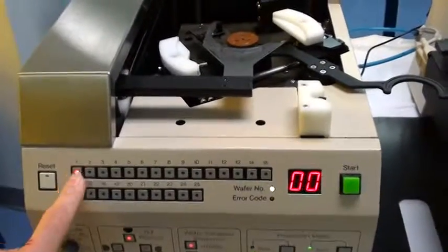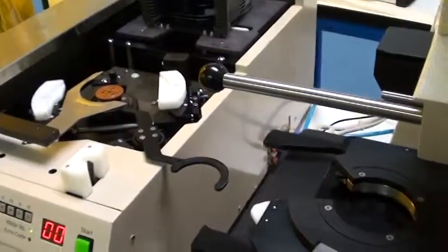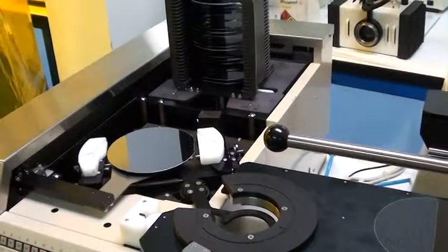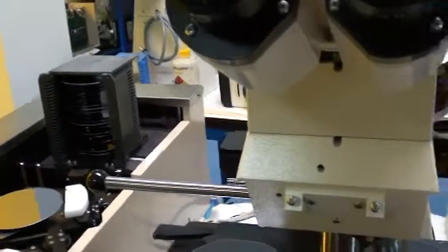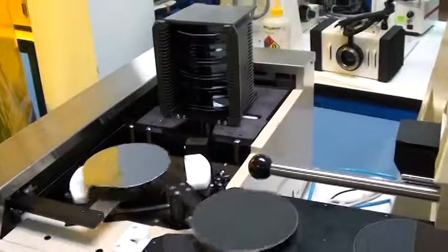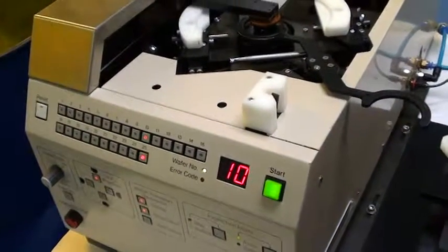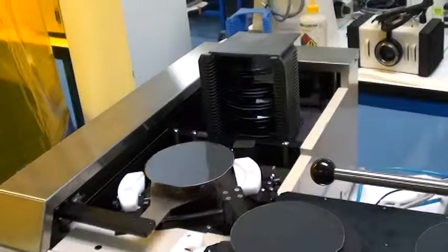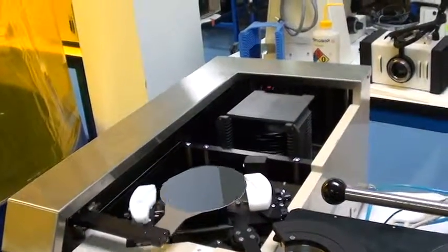Say I want to do wafers 1, 10, and 25 — I can make that selection. I'll bring it in; it will pull a wafer and transfer it. Now transfer back, and it will go straight to wafer 25, then load the wafer back into the cassette.